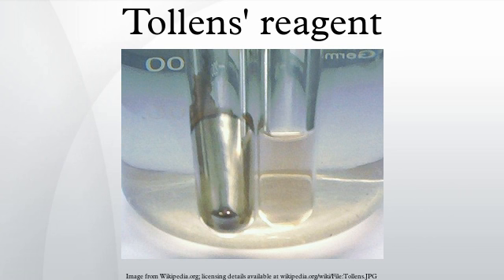Tollens reagent can also be used to test for terminal alkynes. A white precipitate of the acetylide is formed in this case. Another test relies on reaction of the furfural with phloroglucinol to produce a colored compound with high molar absorptivity. Both Tollens reagent and Fehling's reagent also give positive results with formic acid, which is fully oxidized to water and carbon dioxide.